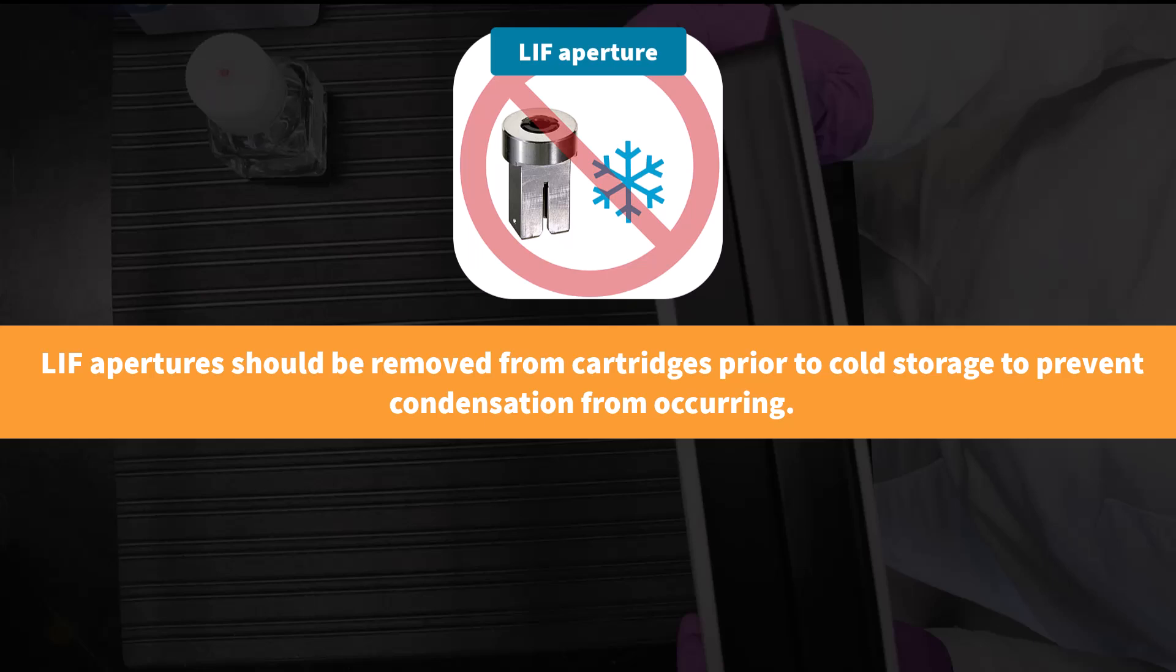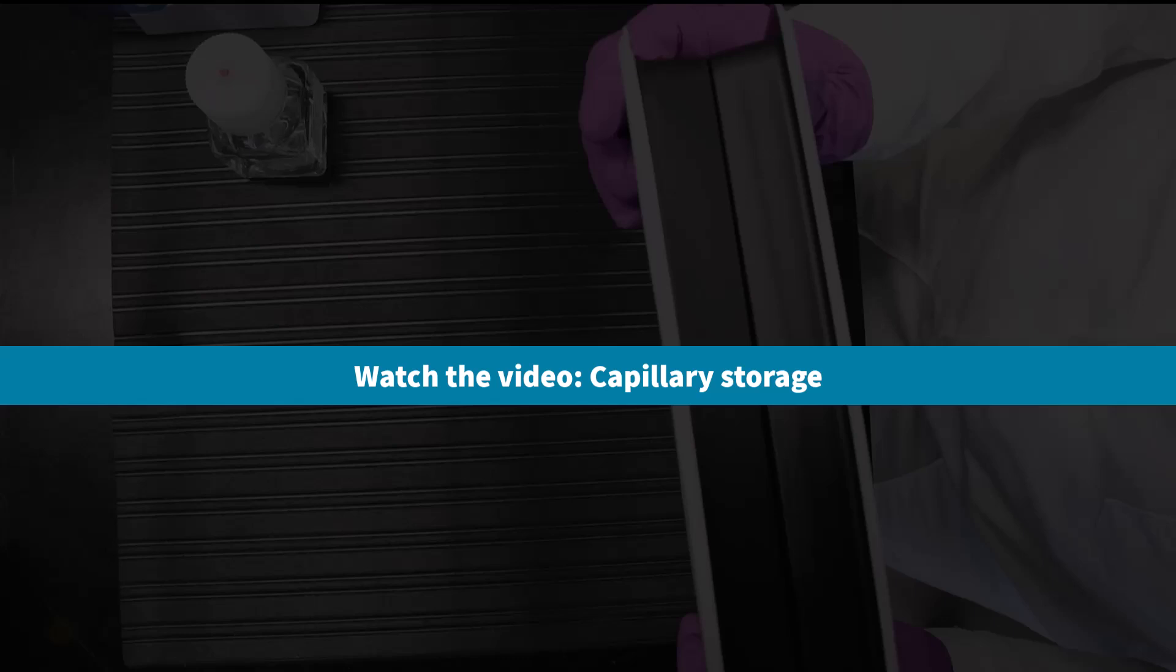This prevents condensation from forming on the metal aperture, which can damage its function. For more details on storing your capillary, watch our capillary storage video.